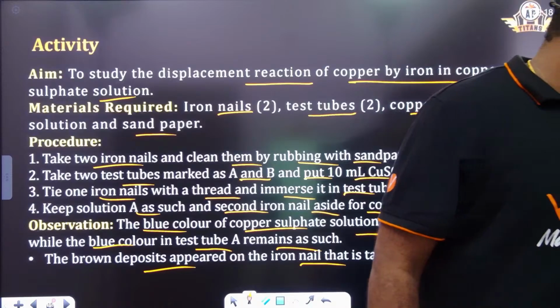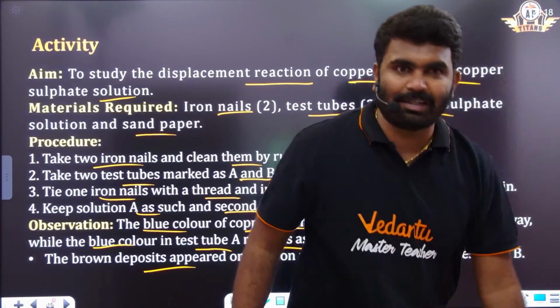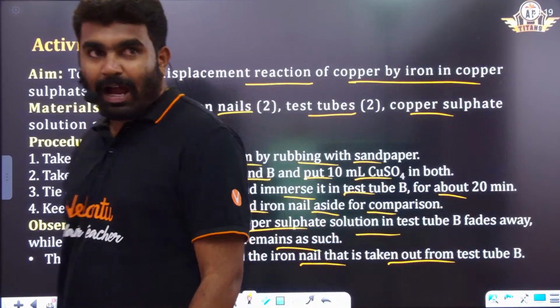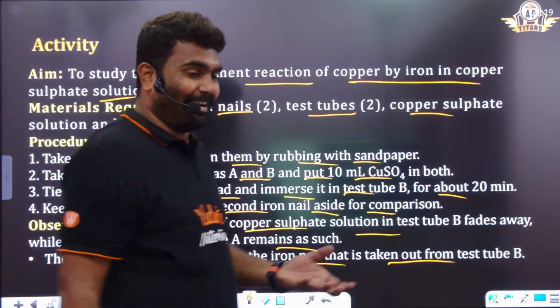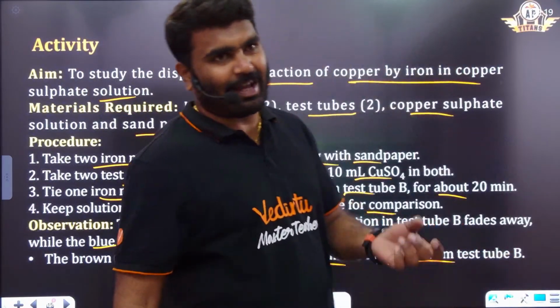Okay. So now, he asked me to keep it aside for 20 minutes. We'll see what will happen. I don't know whether that is an iron nail or not, but it appears to be iron, so that's why I am using it.